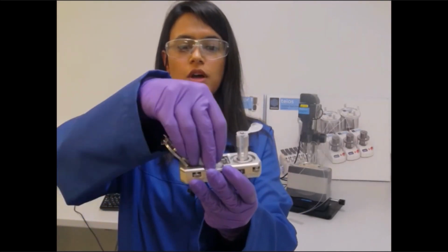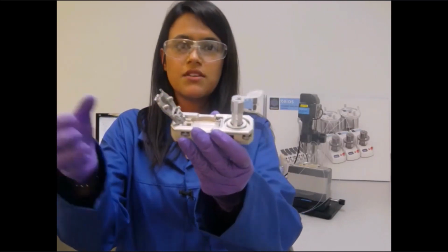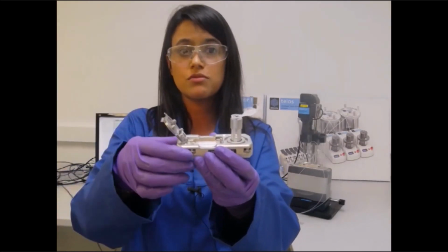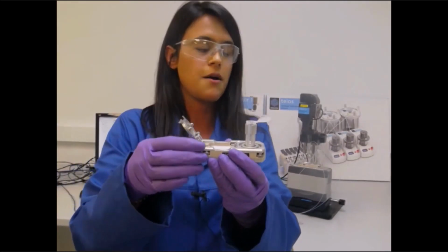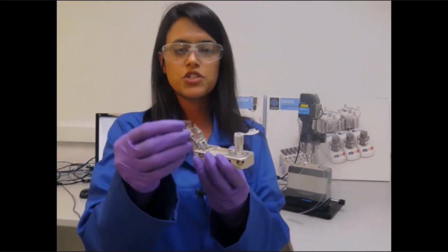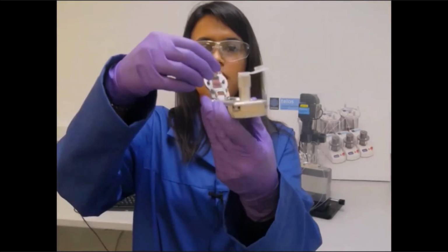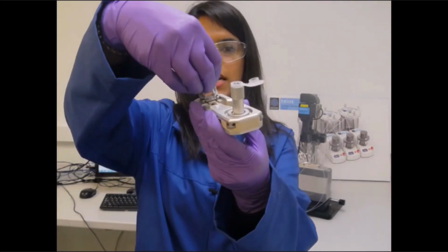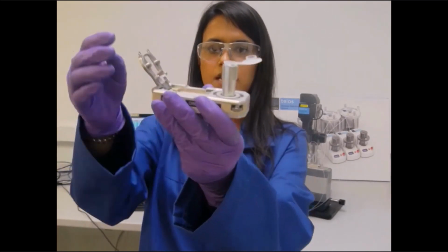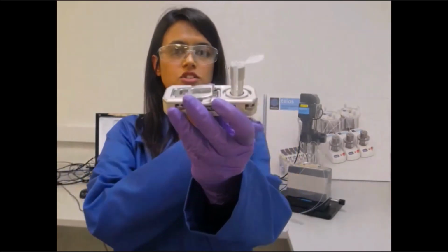This would typically go in the middle here, and using a very standard laboratory pipette, you would load your sample with a P200, and then you would use your droplet chip. So the droplet chips are a little bit smaller, and they look something like this. This then gets slotted into a side here, like this, and then you simply close that and connect the tubing, which is then connected to the P pumps.